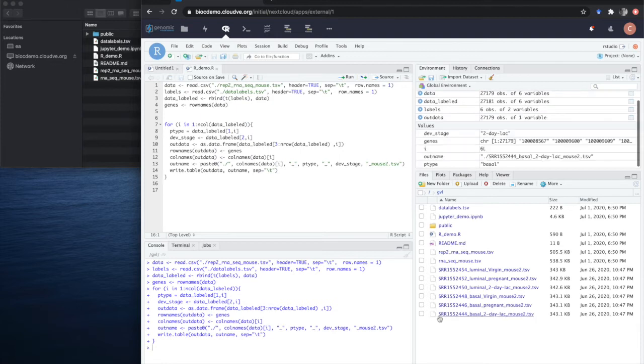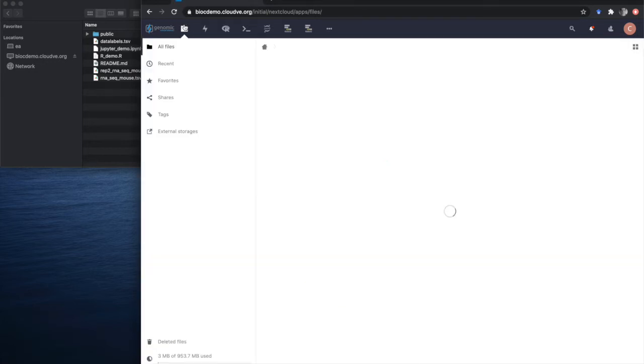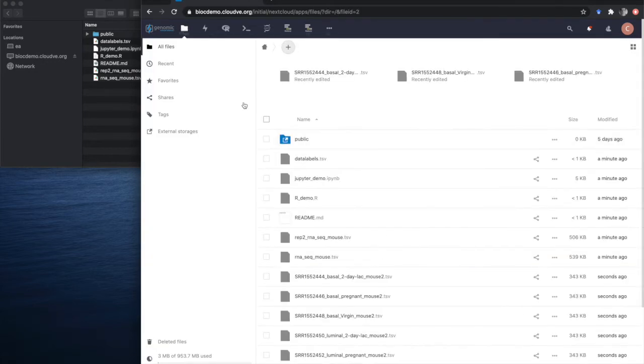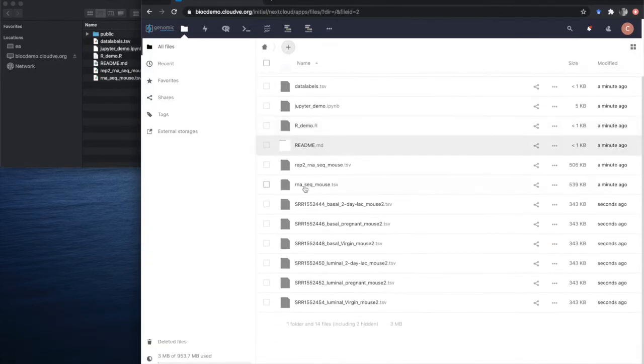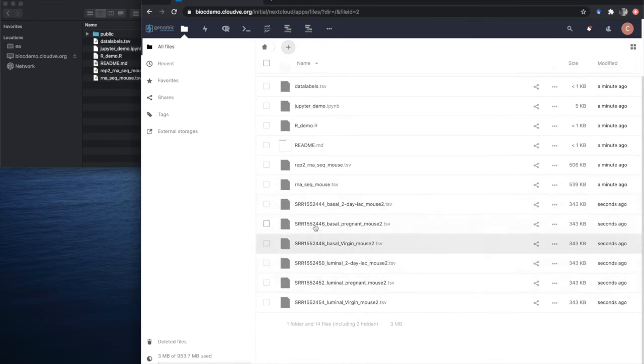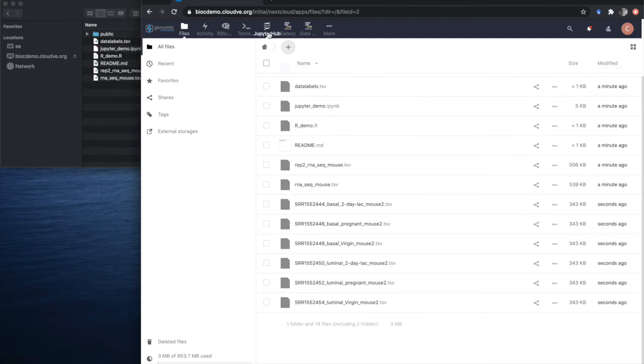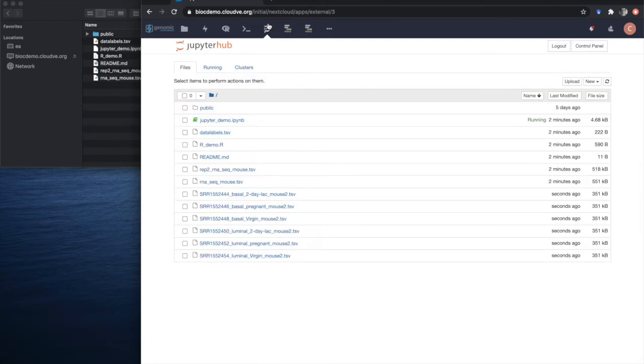These are available in the data browser on the GVL. So if we go back to our data browser and look at the files, the files that were created by RStudio are now also available in the general GVL data browser. These files are also available in other applications.